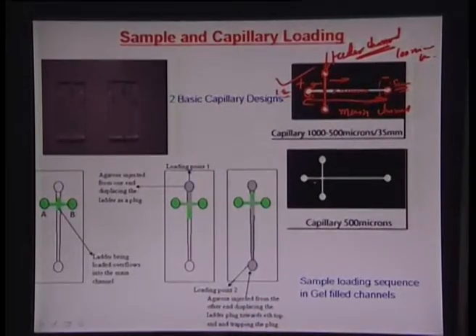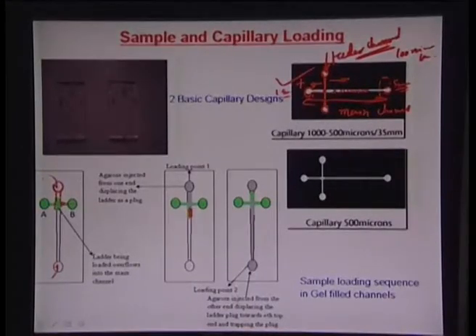Here this process is illustrated in a slightly different manner. Using pressure driven flow, you can introduce this green sample, which is the DNA labeled with dye, onto the small thin capillary here, and you can also simultaneously introduce gel material by a two directional control. The idea is that you leave the gel open for just about a couple of milliseconds. The gel solidifies and hardens and fills the whole capillary. So you now have a plug here of the particular DNA molecule which you can move with electrophoresis.